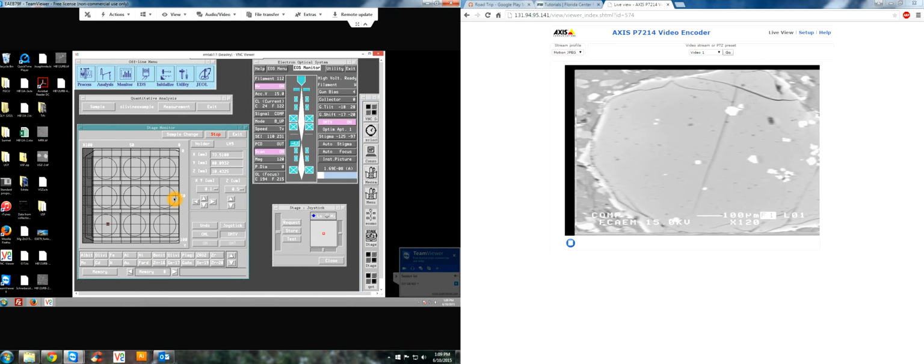Now in the quantitative analysis menu, you should select measurement. Now go to correction method. Since we're analyzing olivine, we'd click on oxide, or make sure that's depressed or pressed. For the correction method, we're going to use the ZAF correction method.